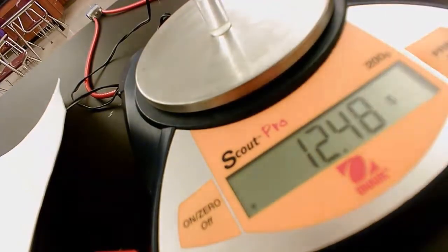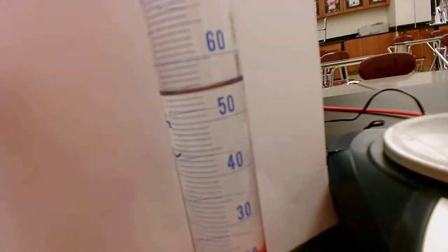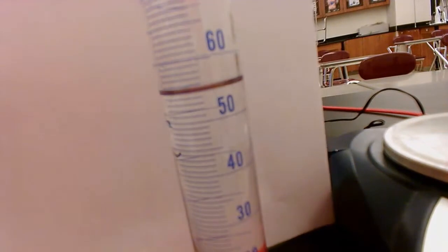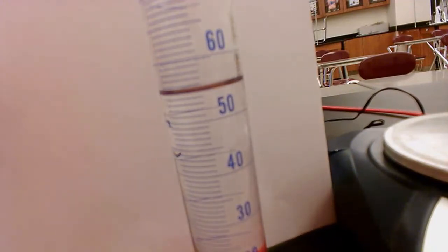All right. Now we need to record the initial volume of the water. Again, this is part C, solid C. Make sure you do the solid that I tell you. Everyone get that initial volume of your water.